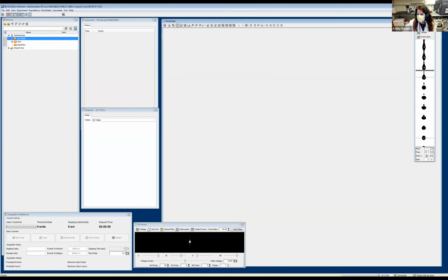And that's where I would make this minor modification to update that value, and then keep an eye on that number as the sort is progressing and as our setup is progressing throughout the day. So that's what I would do to get started when we first sign into Diva and get started with our setup for the sort.